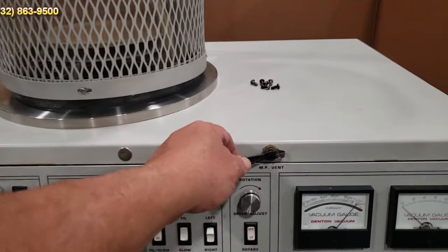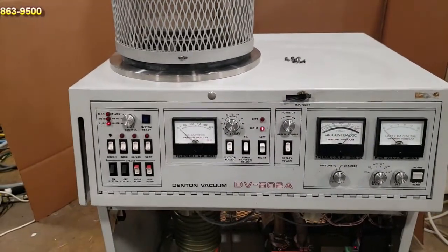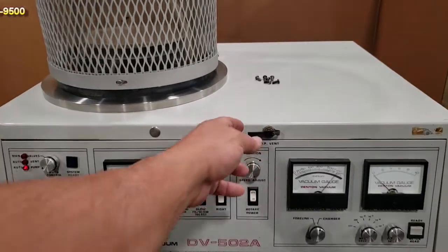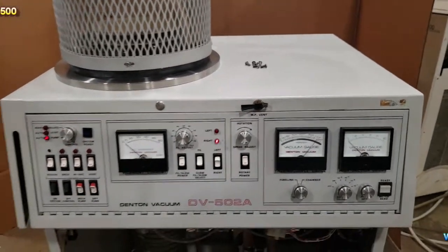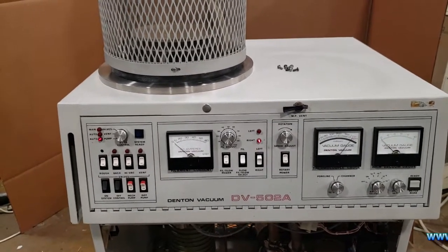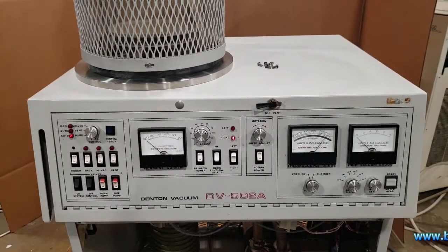This right here is your mechanical pump vent. Basically, when you are done using the system and want to shut it off, what you're going to do is pull this valve open, and that will cause your vacuum lines to be at atmosphere - just so your mechanical pumps don't back-stream.